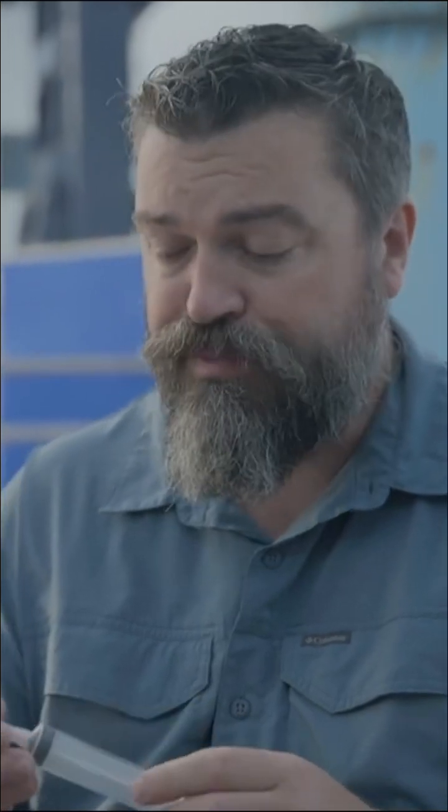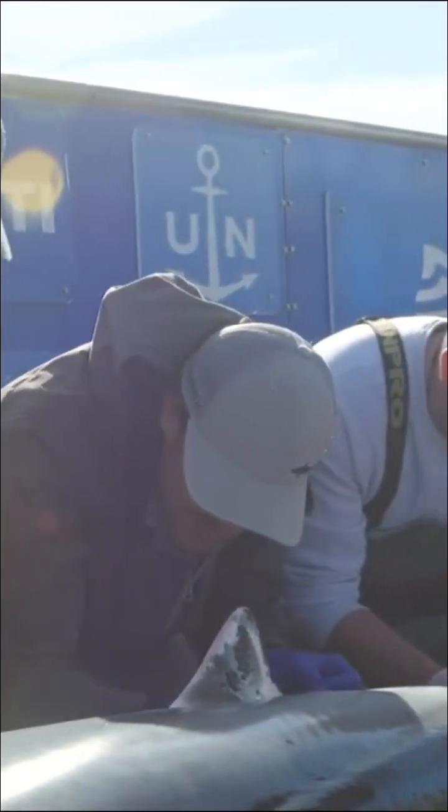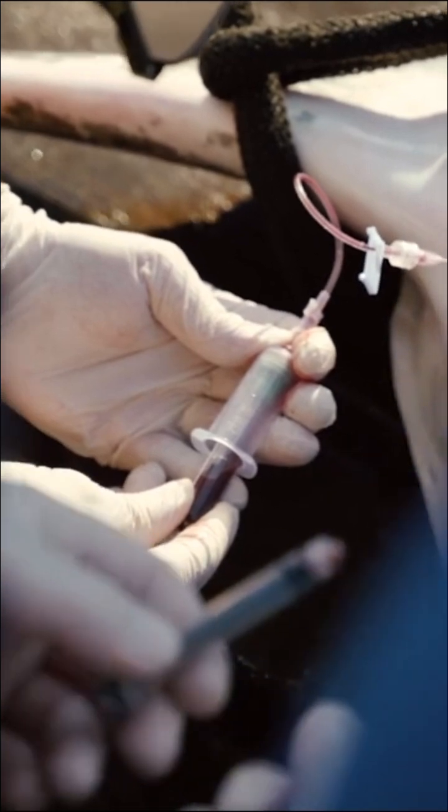Once we get the needle in through the puncture we can draw back blood, but because we are collecting such a large volume — around 24 mils or so — we need to switch out syringes, and that can become cumbersome. A lot of people like to use an extension onto this so it gives you a little bit of leeway so you don't accidentally dislodge the needle from the vein.